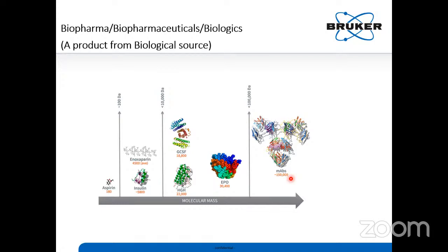Every vendor will have some mass accuracy level for every model, tried at a particular mass, with a particular sample. They can't say exactly what the mass accuracy is at 150,000. So when your mass is increasing step by step, your mass accuracy error will be more. Why I am mentioning this, we will discuss in the next slides.